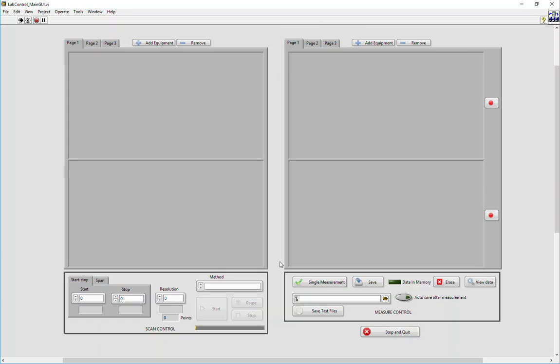On the measurement side panel, we can also have up to 6 measurements, and those can be any sort of equipment that require some recording or data transfer, where we want to record some data and then transfer them to the computer. Some instruments can be used as both measurement and control. In that case, it must be properly defined in the instrument definition, which we will be showing later, and it will be added on the measurement side only.